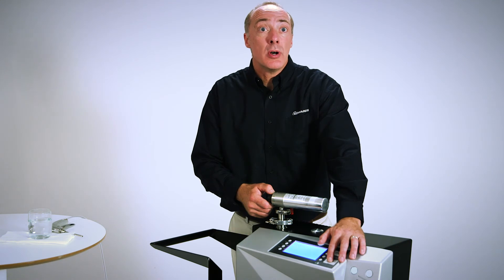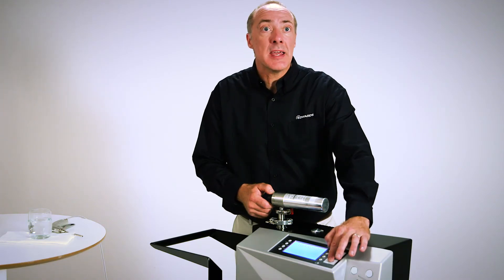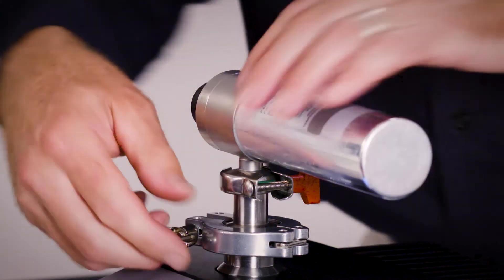Pressing stop returns the ELD500 to standby but leaves the test port under vacuum. Pressing and holding stop again vents the test port, and you can then remove the piece under test.